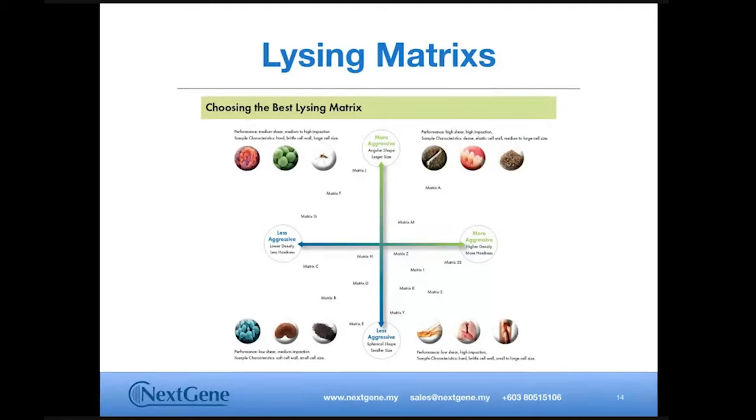Okay, this one is a bit tricky, Prof. Not so tricky, but it might actually need another technology. So if, let's say, Prof needs to identify unknown DNA or RNA virus, one of the things that we can try is using next generation sequencing. But the challenge will always be, we have some customers trying to do that also. The problem is that the sample might contain too many other community members like bacteria and other living organisms. So their DNA, because in NGS we actually sequence anything and everything.